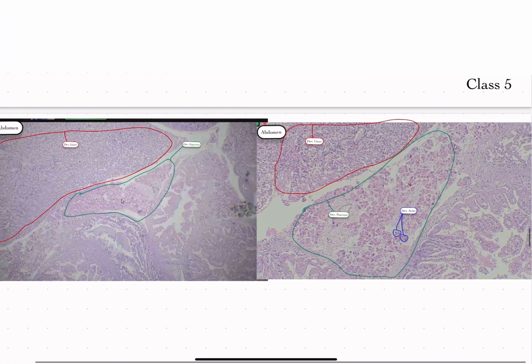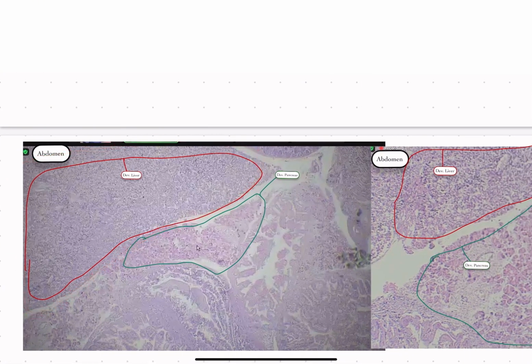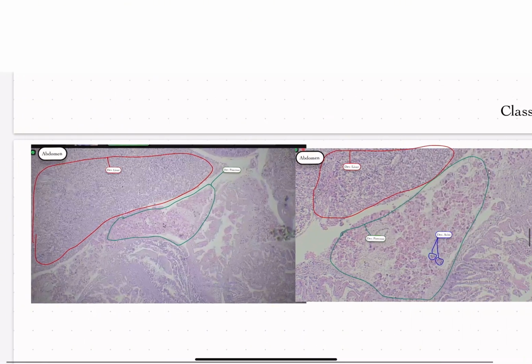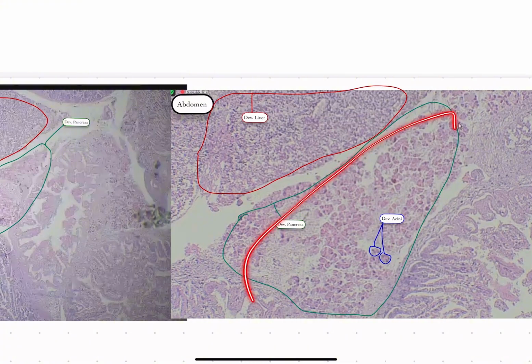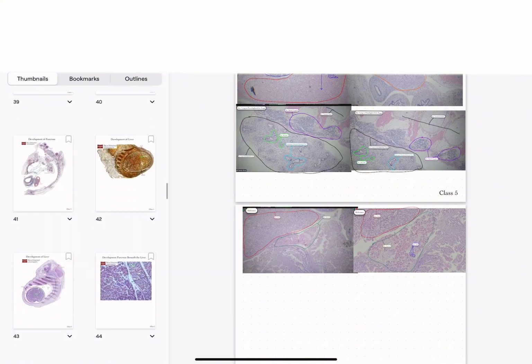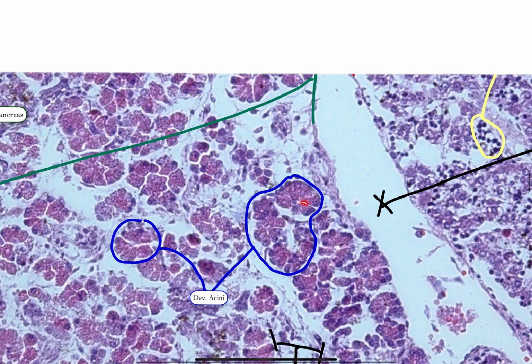But here we go. This is actually a lot better. So like I said, the developing liver, and then we have the developing pancreas underneath, usually red in color and close to the intestinal loops, but directly underneath the liver. Now zooming in here, we can see the liver and the pancreas like so. And then within the pancreas, we actually have the developing acini, which if we zoom in, looks something like this. So they look like these flower-shaped structures, like so, with all of these petals. This entire structure is known as the developing acini.